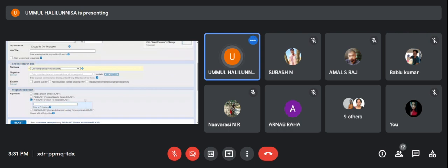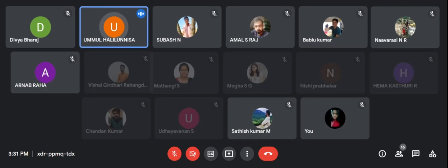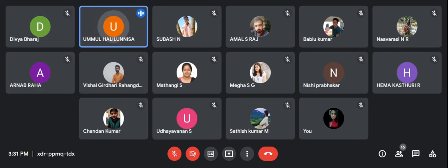We'll try to create one pattern, right? You have studied this in your class itself, right? So first we will try to find a pattern for our protein sequence of interest. Then with the help of the patterns, we'll try to find similar kinds of proteins, whether they are there or not. For doing that, we'll use a tool called ScanProsite. ScanProsite will not give you a pattern. PRATT will give you a pattern.